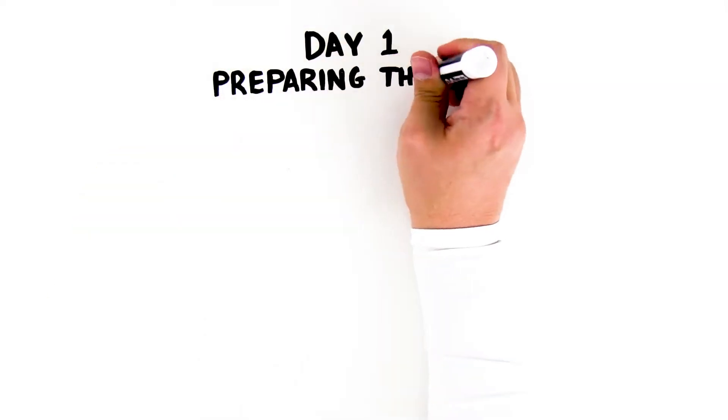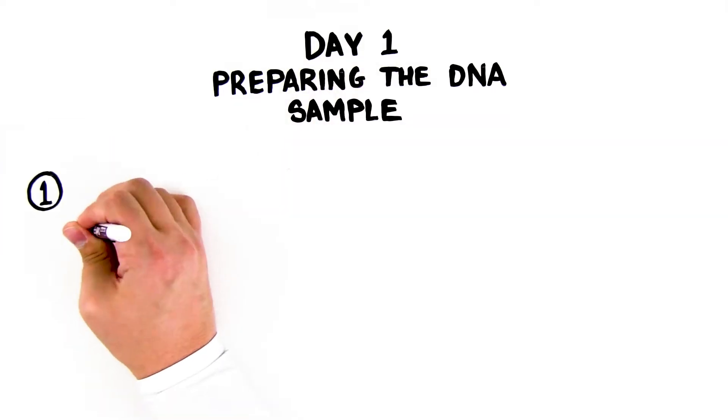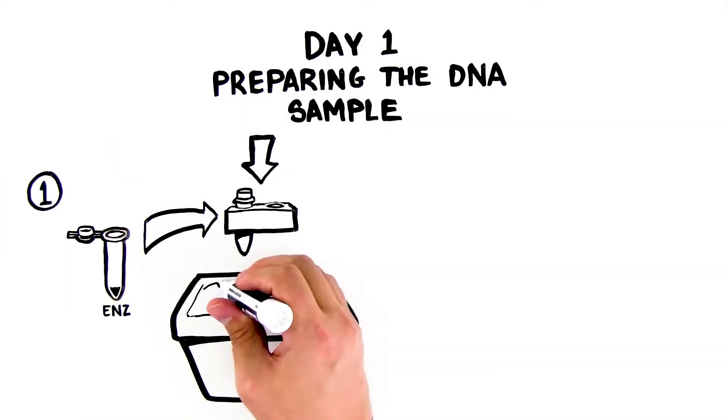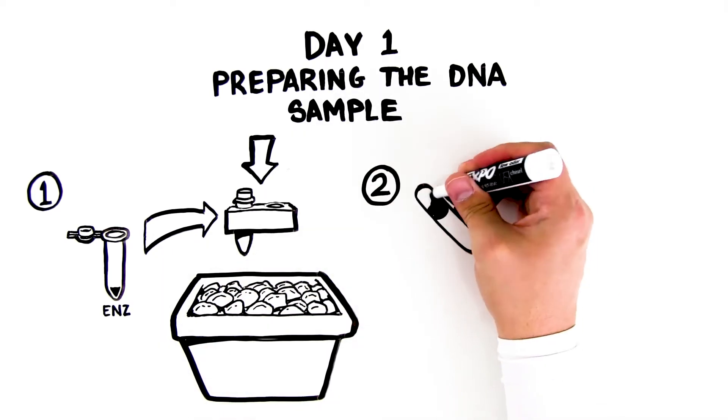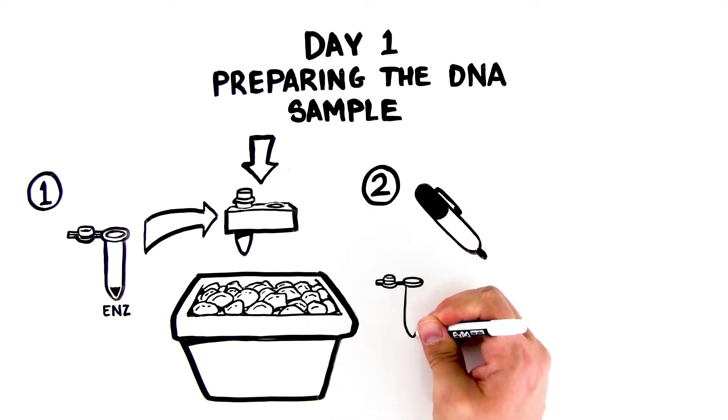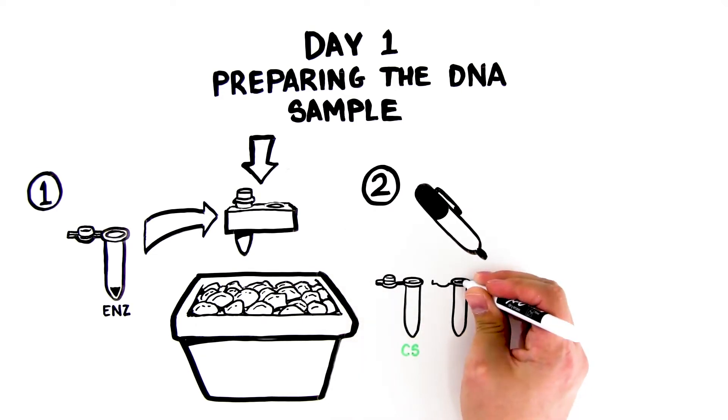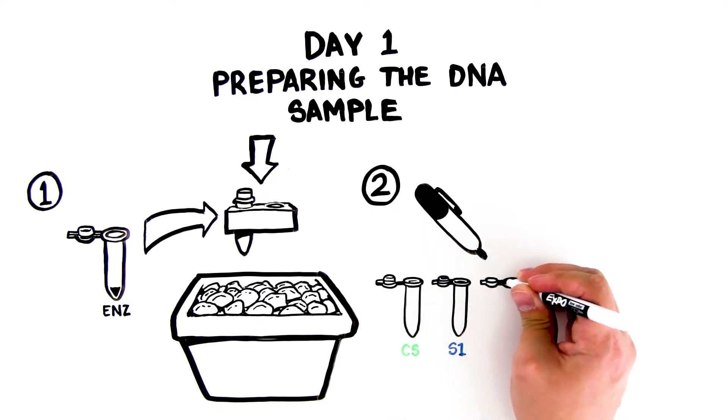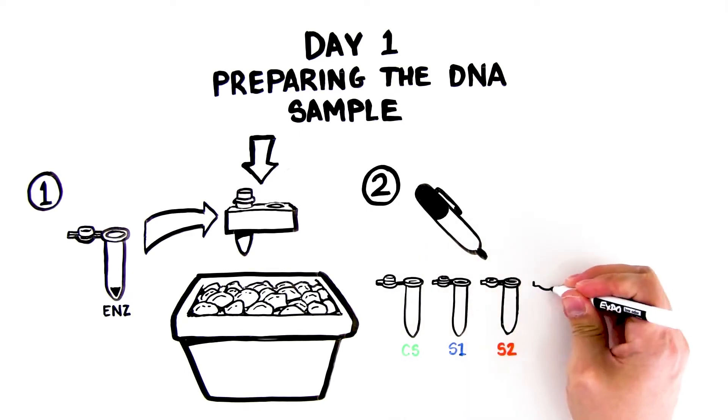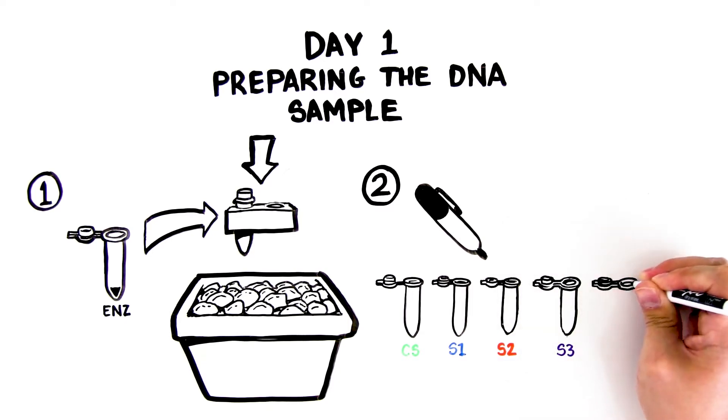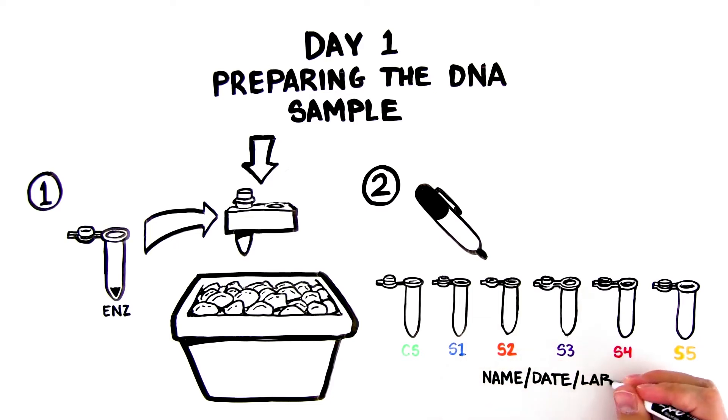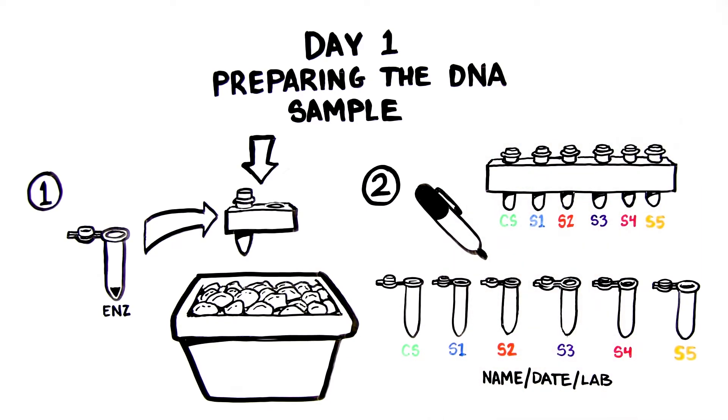Day 1. Preparing the DNA sample. First, place the tube containing the restriction enzyme mix labeled ENZ on ice. Second, label one of each colored microtube as follows: Green CS equals crime scene, Blue S1 equals suspect 1, Orange S2 equals suspect 2, Violet S3 equals suspect 3, Red S4 equals suspect 4, Yellow S5 equals suspect 5. Label the tubes with your name, date, and lab period. Place the tubes in the foam microtube rack.